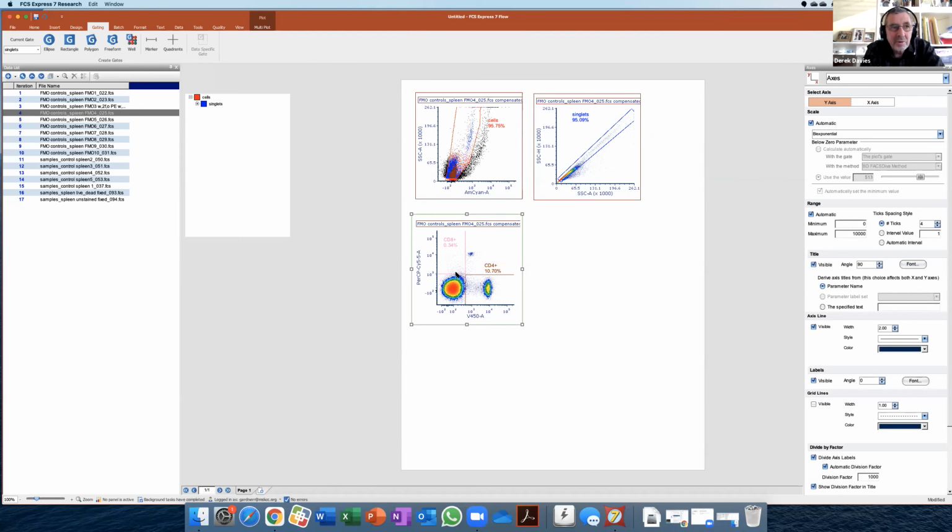Exactly. I suppose you have to apply a bit of reality to this as well, don't you? I mean, you could set that marker so that there are absolutely no dots above it, couldn't you? But you might end up setting that in a completely unrealistic position in that case.